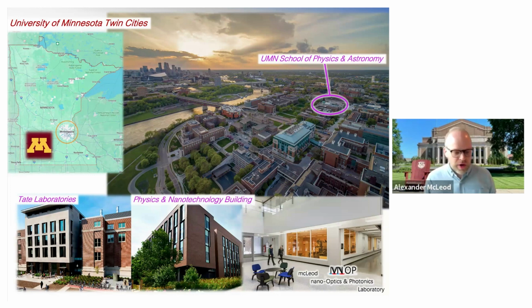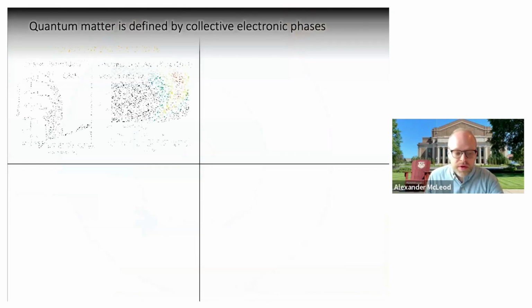So we're still in the early days, but I hope to share with you today some fantastic new results that have been partly enabled by collaboration with Park Systems to enable some fantastic new imaging and nano-spectroscopy tools and capabilities to take a look at these quantum materials.